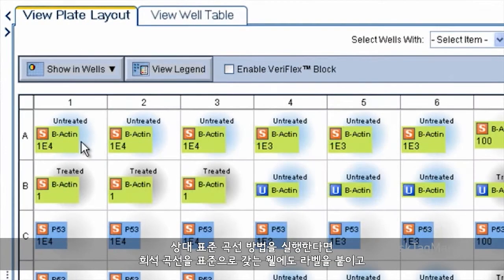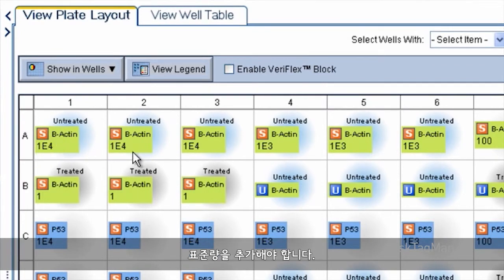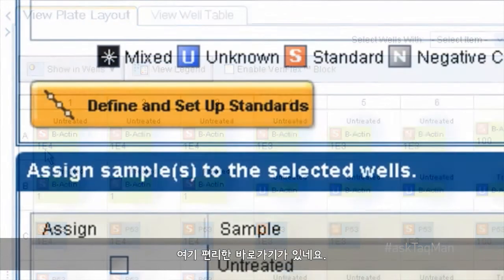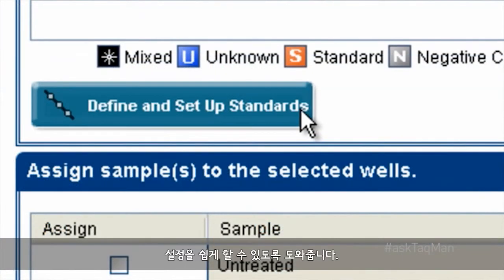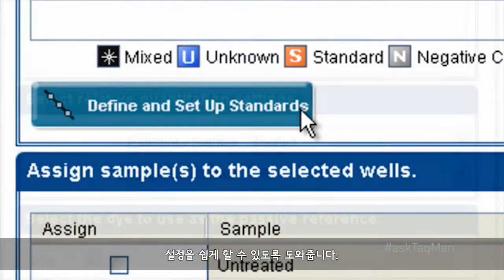If you're running the relative standard curve method, be sure to also label wells containing your dilution curve as standards, and to add standard amounts. There's also a handy shortcut key that really helps set these up.